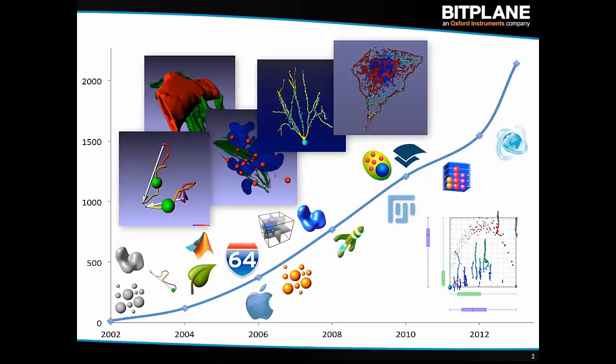One is a forum where you can exchange information about Imaris, about image analysis. And the other one is where you can exchange plugins for Imaris. They're called extensions, but just like Imaris plugins. There are also some people that develop extensions, and they are aware of this platform and they use this platform too. And if you want, you can actually request an extension. Sometimes they will listen and they might actually do something. Other times they just do whatever they like. That's fair enough.